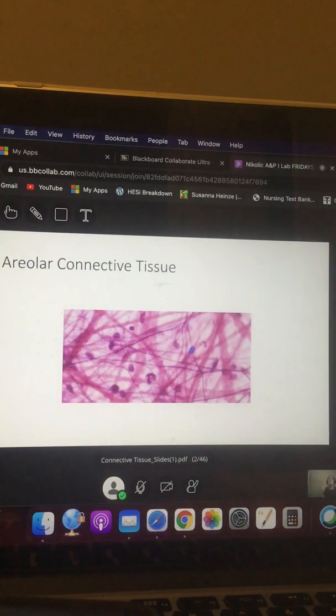And don't call it a nucleus because look, guys, on page 40, under number 7, do you see nucleus there? Does anyone see nucleus on page 40, connective tissue, number 7? There is no nucleus. So don't give me a nucleus because I am not going to give you a point. I will give you a point if you tell me that is a fibroblast. You with me? I will give you a point for a nucleus if it's under the little thing under epithelial tissue.